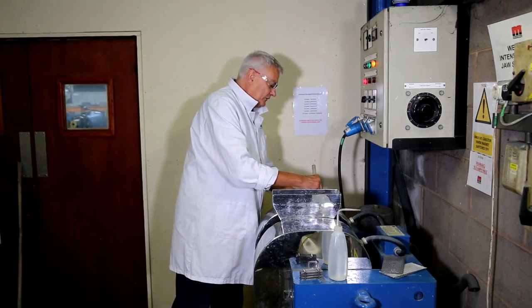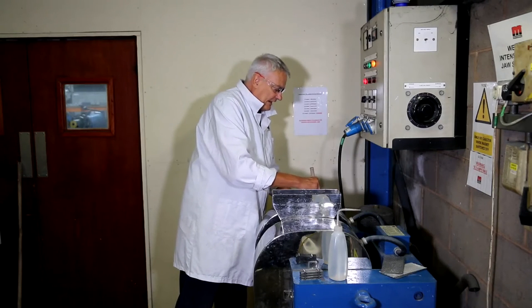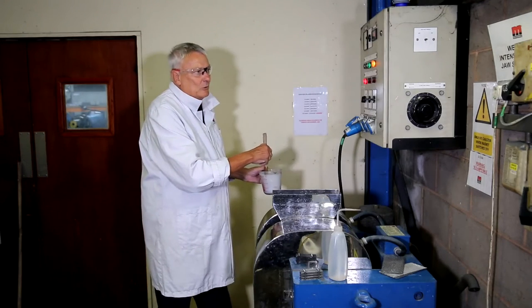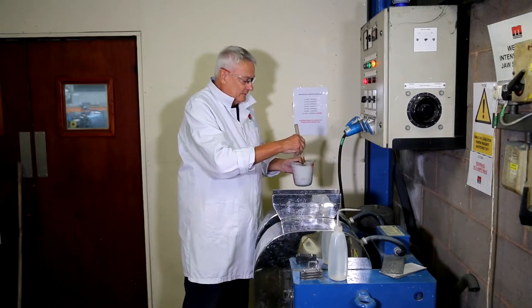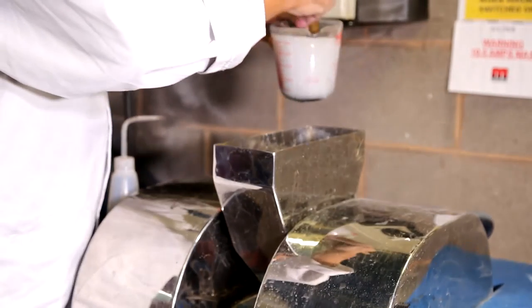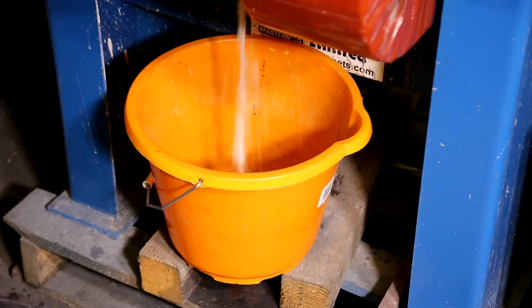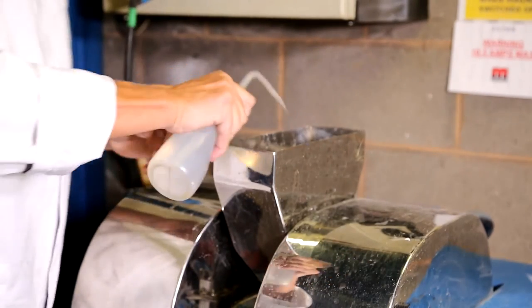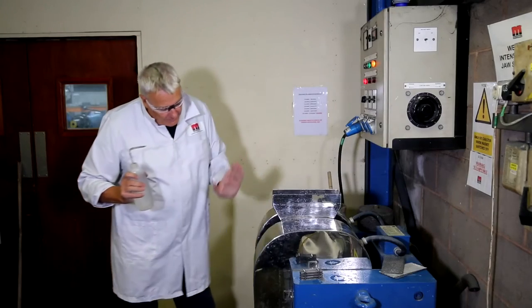The suspension we feed into the machine is often dispersed — we add a dispersant to allow the particles to separate out and not interact with each other. Normally we run at a suspension solids level of about 20% by weight. These machines are normally gravity fed — it's quite a simple process. We just pour the material through, and wash through any material that hasn't quite gone through. What's happening now is the magnet is holding the paramagnetic particles, and the non-magnetic material has passed through.